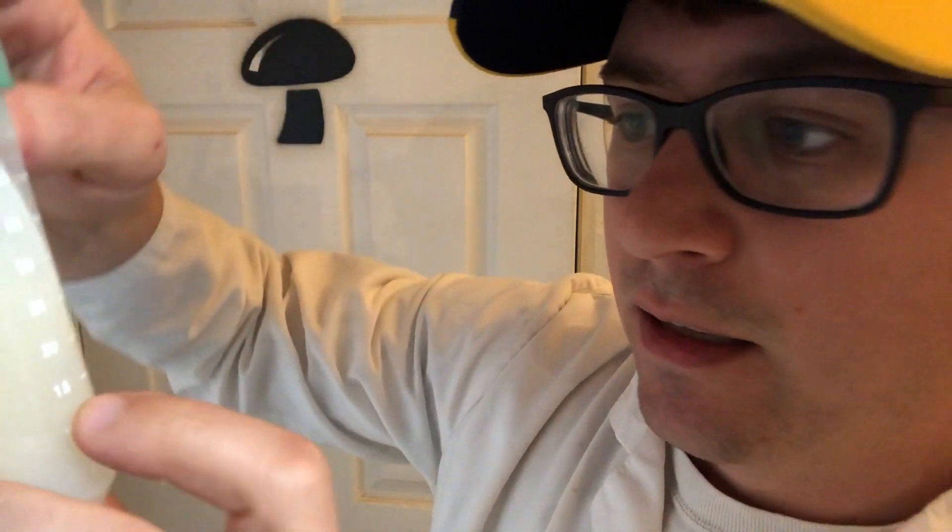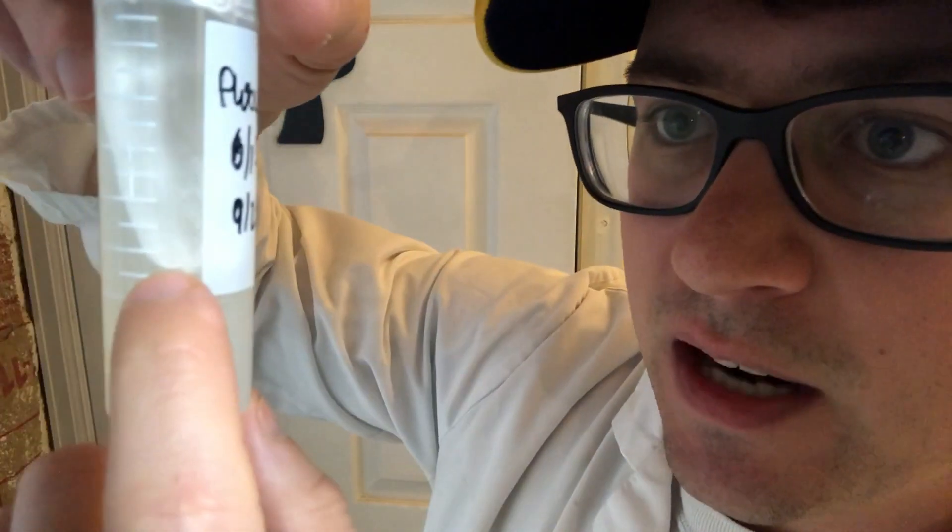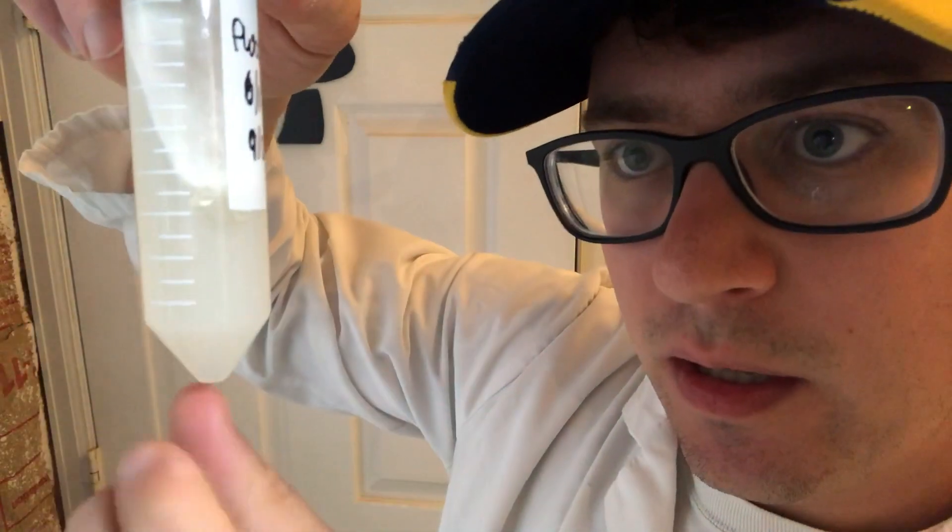You can see this slant, which is about a year and a half old — I usually transfer these sooner, but this is a strain I don't grow anymore. You can see there are some signs of gas exchange and the mycelium has started to dig into the media, reaching deep into the butt of the slant to get its nutrients.